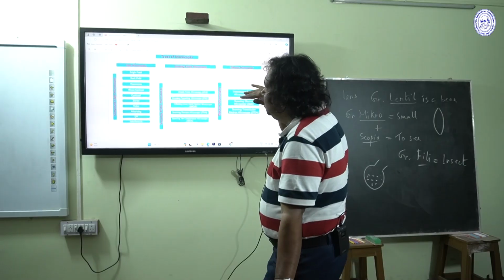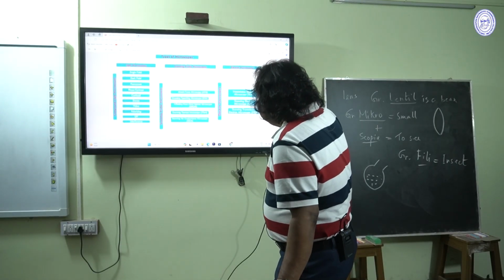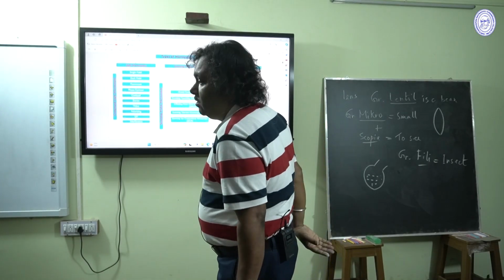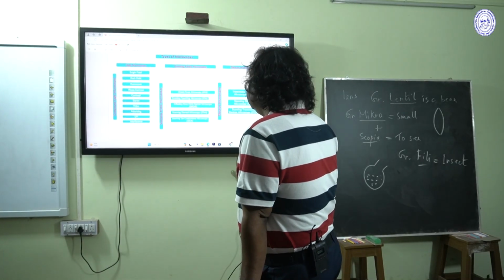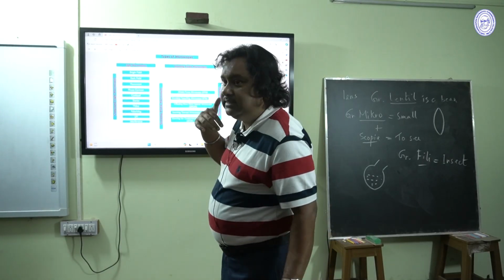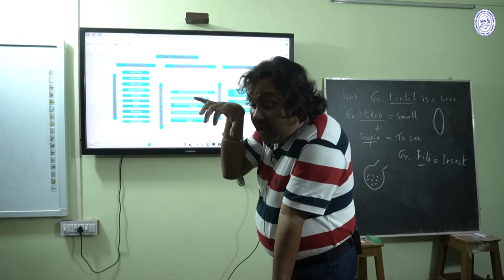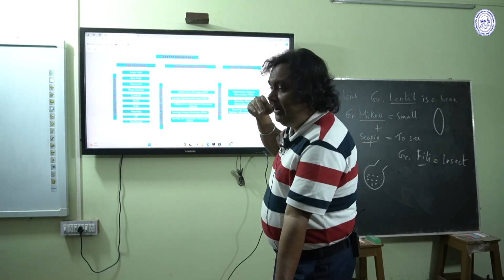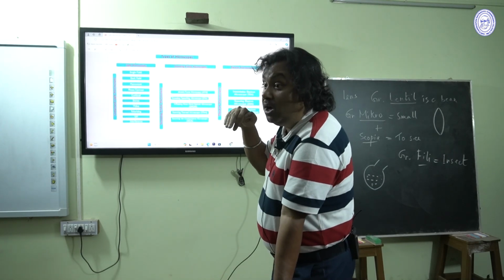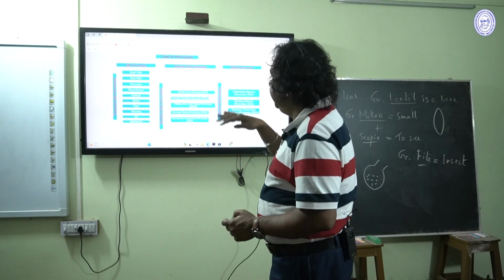Microscopes are divided into 3 categories: light microscope, scanning probe, which is a special type of microscope, and electron microscope. In case of light microscopes: bright field, dark field, fluorescence, phase contrast, confocal, stereo, video, polarizing, UV, interference. All these are under the light microscope, where the visible range of light is used as the source of illumination, except in UV, where UV light is used.